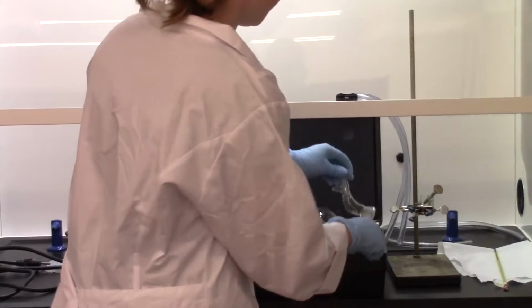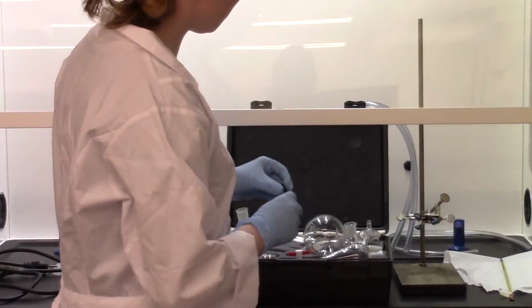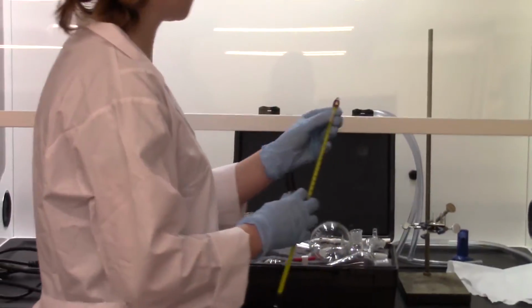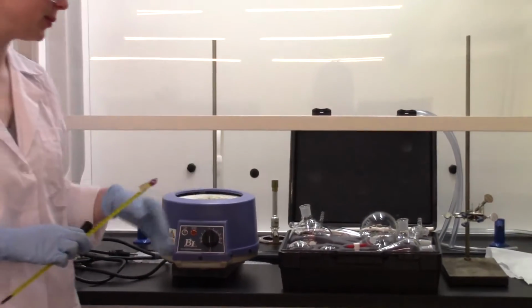along with attachments for the thermometer and 2 stands along with a heating mantle for the distillation round bottom.